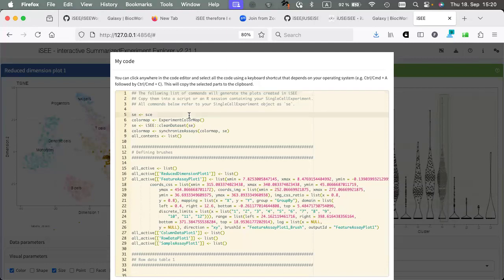You take this, Control-A, Control-C, Control-V, put it into a notebook, like a Quarto notebook, and it gives you exactly these things. It can be super cool for two reasons. Save your time. It can be a learning way, or a didactical tool to say, this is how you can actually do these plots. You literally start your session by saying, I need an SCE.